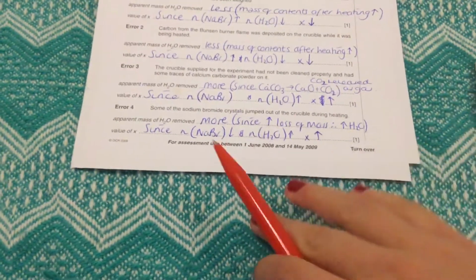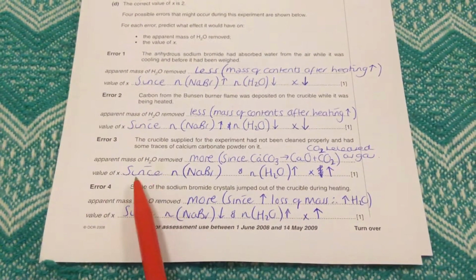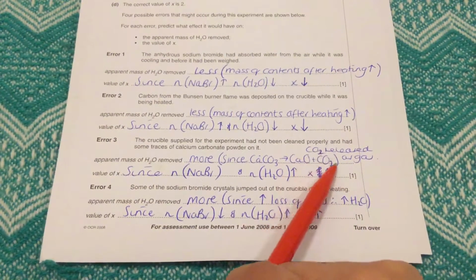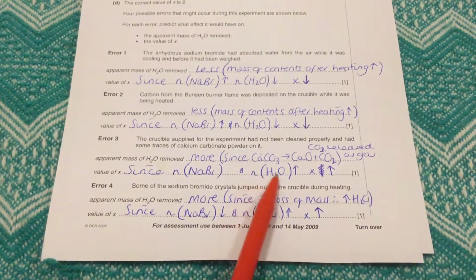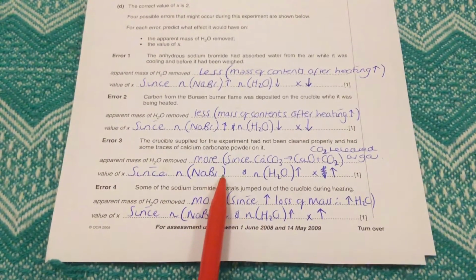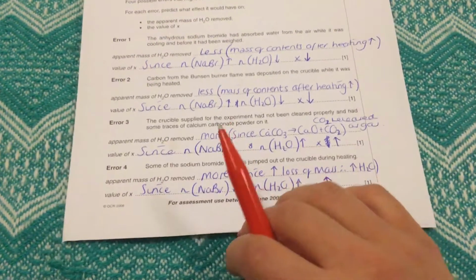The next two errors: the crucible supplied for the experiment had not been cleaned properly and had some traces of calcium carbonate powder on it, which we wouldn't be aware of until afterwards. The thing here is that when you are heating it, calcium carbonate will decompose into calcium oxide and carbon dioxide. So we're actually producing a greater volume of gas. This means that our water is going to appear to be greater. And our NaBr, we could suggest that would remain the same, or it could decrease, depending on how you look at the decomposition and how you treat the initial mass.